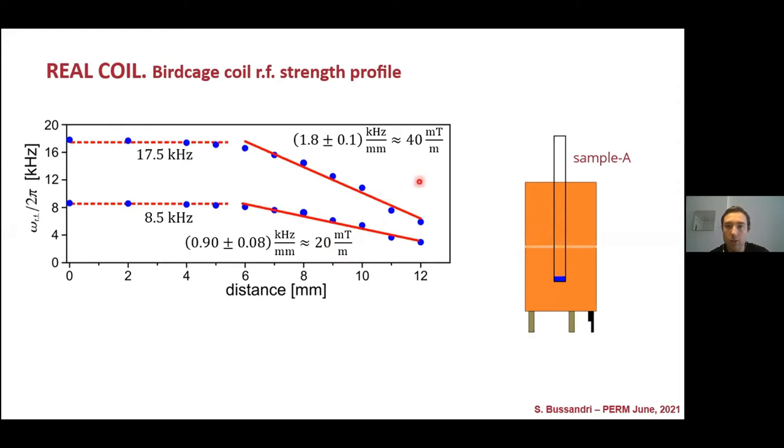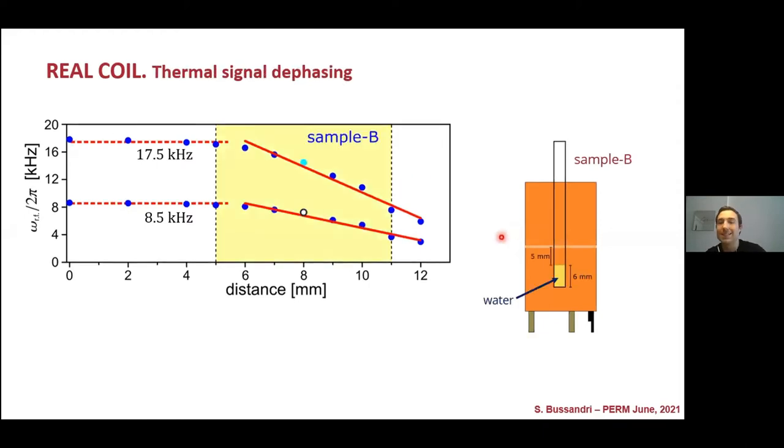The next thing that we want to test is that if we put a sample in the inhomogeneity region of the coil, it will suffer signal dephasing as we calculated before. So again, we place a 6 mm length sample of water, place it 5 mm below the center of the coil.